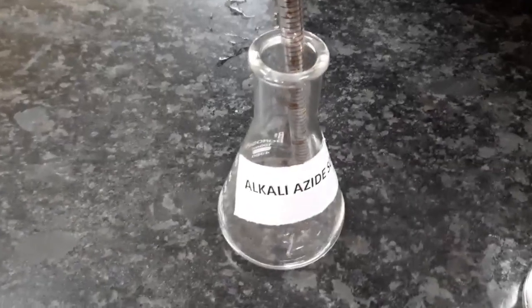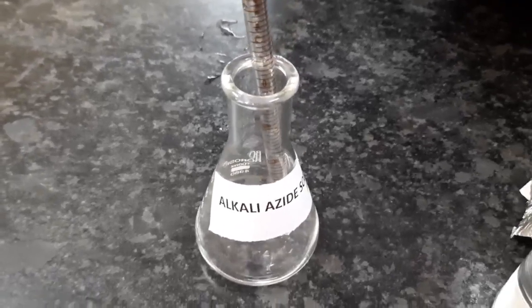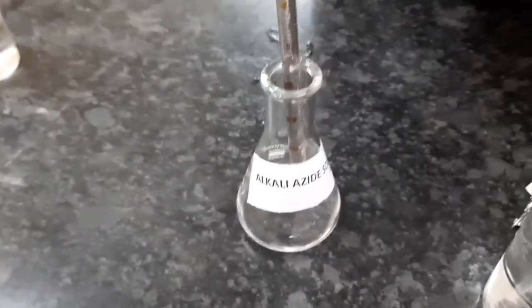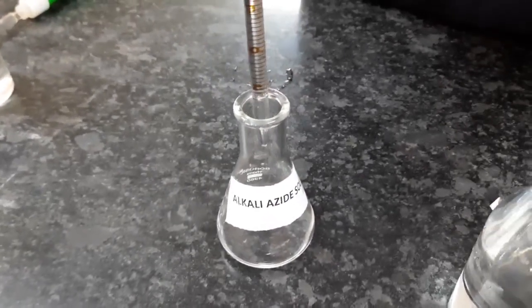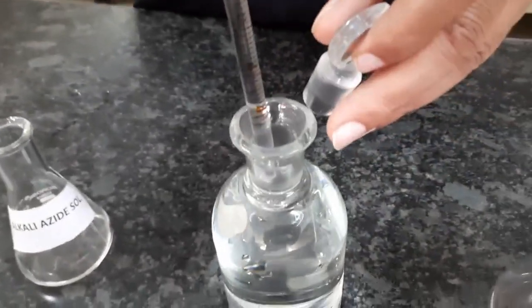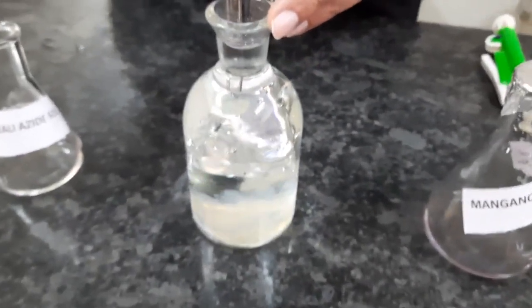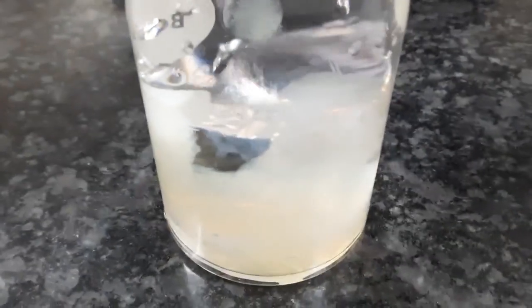The second reagent we are going to add now is the alkali azide solution. This has to be always taken with rubber teats or with a pipette sucker, so that you never pipette this alkali azide solution by mouth. So 2 ml of the solution is taken and then it is introduced into the bottle. You see the cloudiness that is formed in the water.